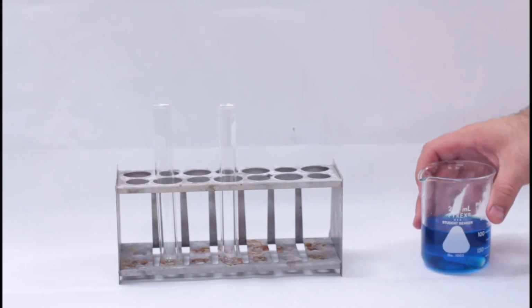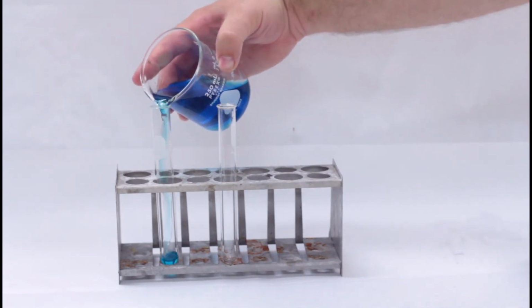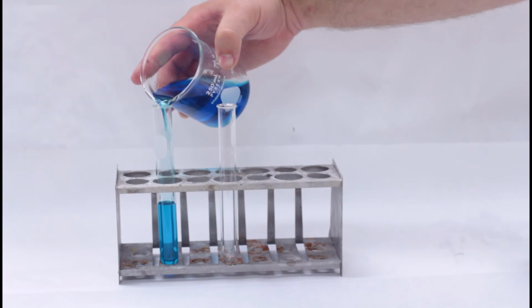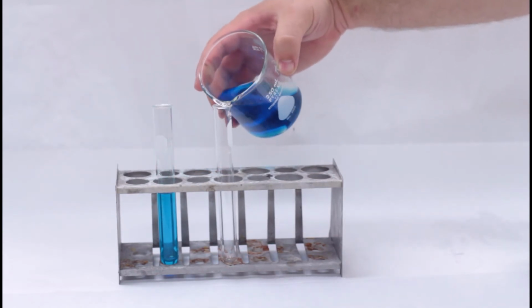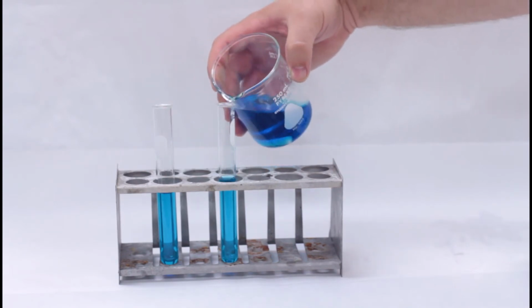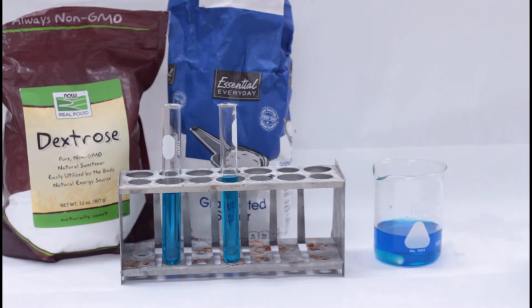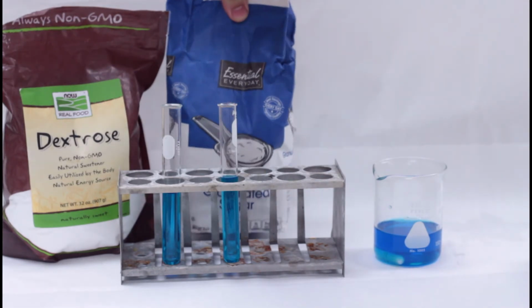Once the reagent is prepared, label your test tubes. Label one sugar 1 and the other sugar 2. Then fill them halfway with Benedict's reagent. Save the rest of the reagent. I'll be collecting it for use in a biology lab. At this point, you should prepare the Tollens' reagent, but I'll show you how you'll test the Benedict's solution now.